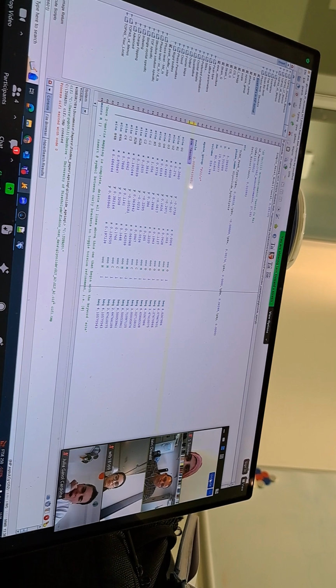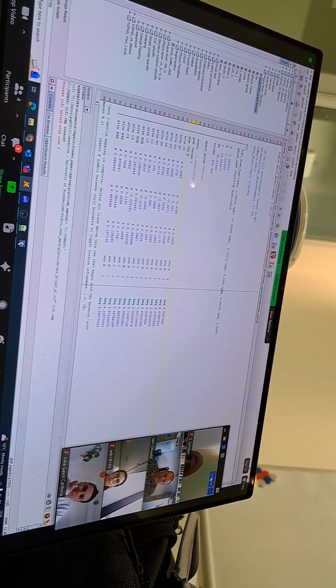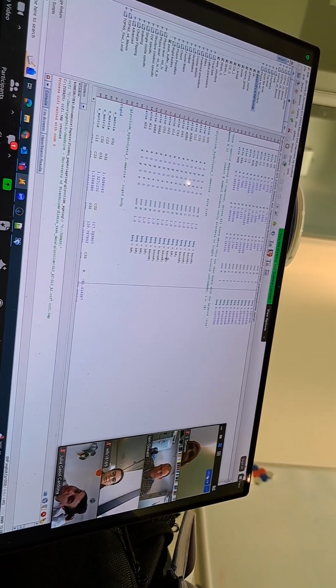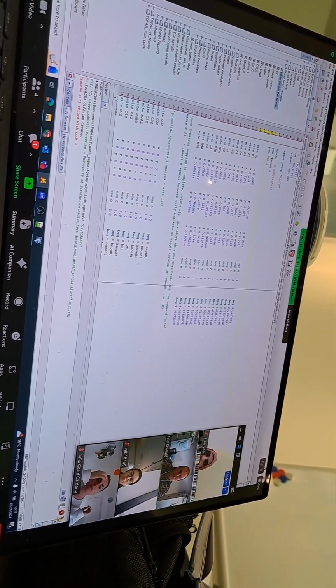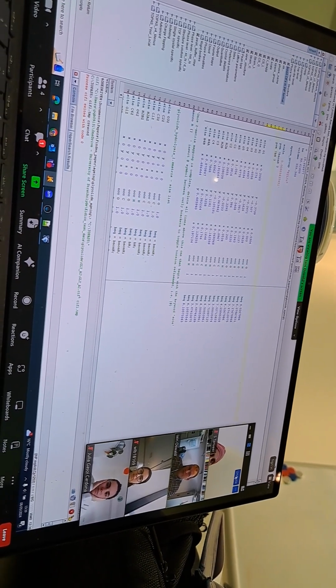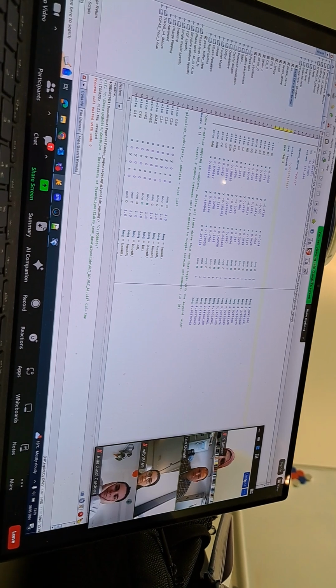It's then going to complain that the BH is not right, because my BH is not right. Right, so my nomenclature here is not quite right. H. It's not happy with the capitalization and so forth.